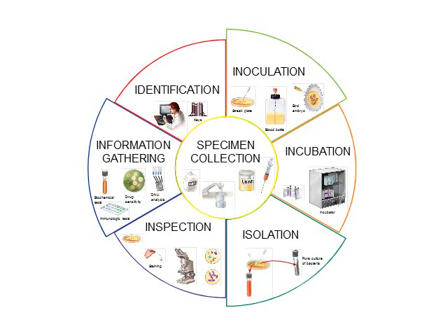In microbiology, we have something called the 6 I's. And it first starts off in the middle, and we actually have specimen collection that occurs first. And specimen collection, this can come from environmental samples. It can be specimens collected off of animals or people. So like urine, blood, water, just surface swabs, for example. After you collect the specimen, we're first going to go to the top right hand where it says inoculation.